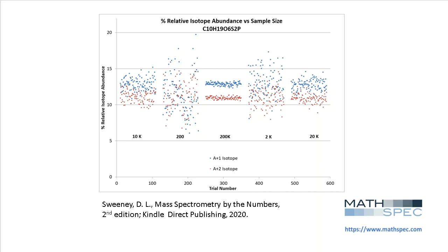Although not addressed with this add-on, the ratio of individual isotopes of the same element varies with the sample. For every million atoms of the element hydrogen in a sample on Earth, we would expect about 26 to 184 occurrences of deuterium atoms.